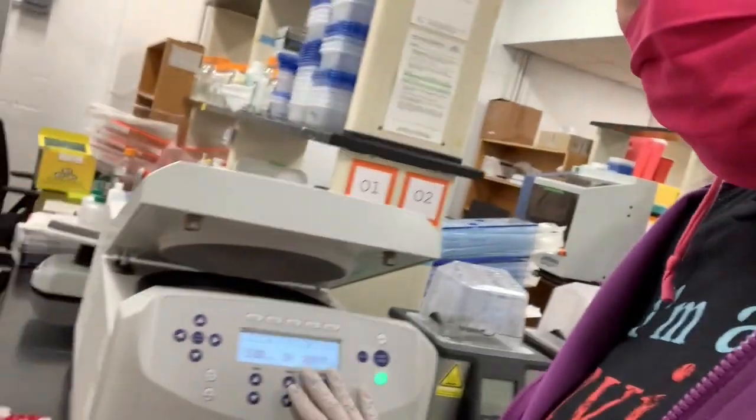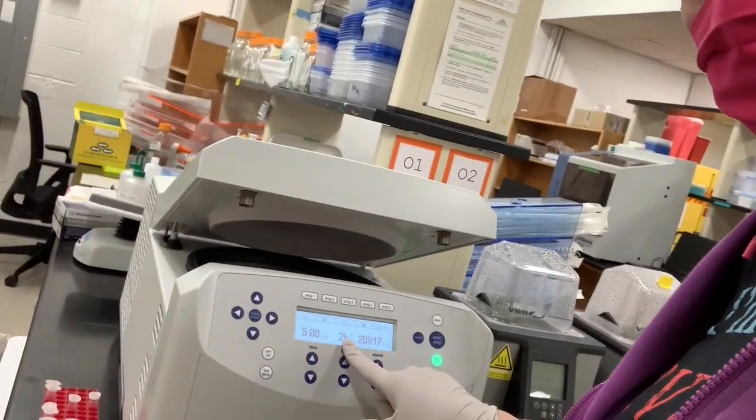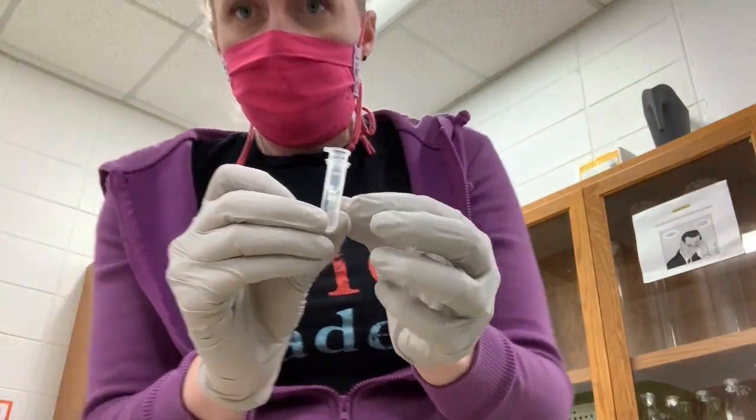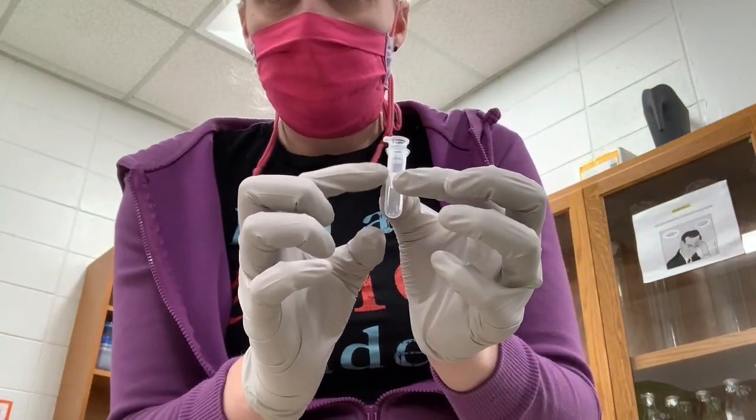This purification needs to happen at room temperature. So if you're using the temperature controlled centrifuge, you need to make sure that the temperature is set at about room temperature, which is 24, 25 degrees or something along those lines. Okay, so centrifugation is going to pull the liquid down from the column into the collection tube.